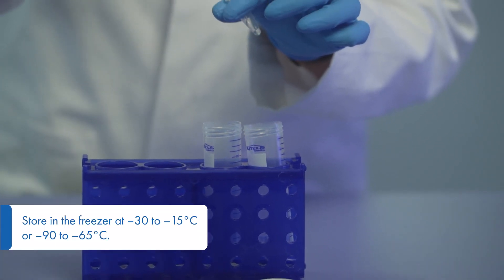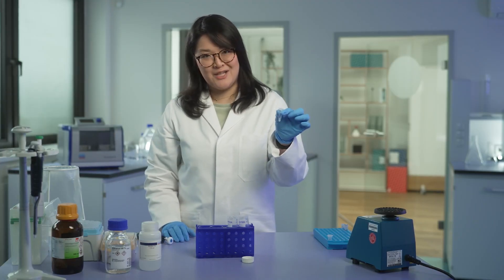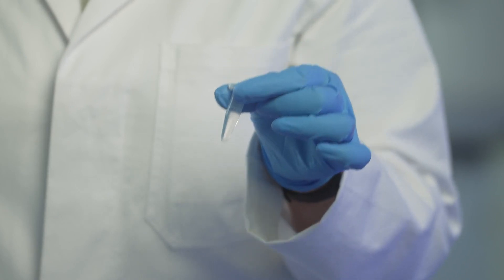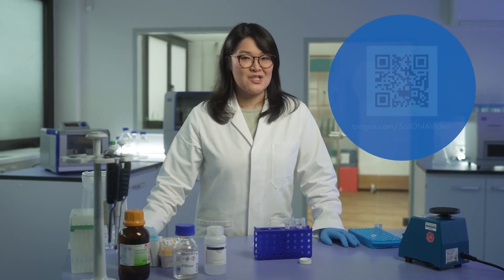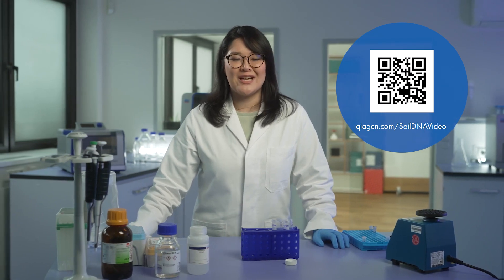Then centrifuge one last time. Transfer your eluate into a 1.5 ml low-bind tube for easier storage. And that's it! Your RNA is ready for downstream applications such as RT-PCR or gel electrophoresis. If not used immediately, store your RNA in the freezer to prevent degradation. If you're interested in soil DNA, follow this link and join us for our next challenging sample.